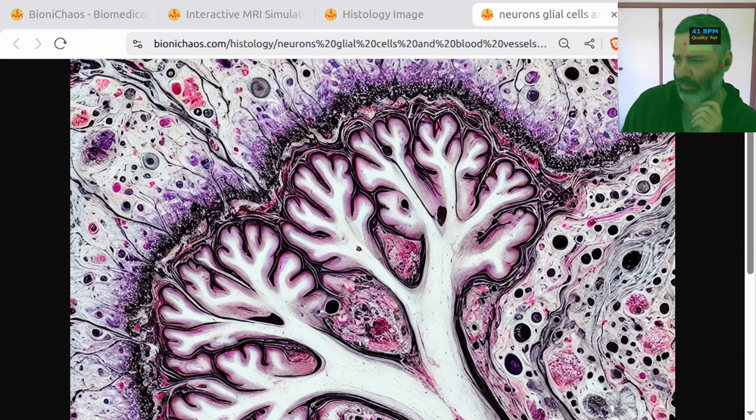Sure, cell counting finds and counts cells. Tissue classification labels different areas, and measuring shape or size helps understand structures. Density tells how packed things are, and co-localization looks at how different parts relate spatially. Feature extraction picks out measurable traits, and segmentation highlights regions. These tools help analyze the image step by step, even if you're new to it.